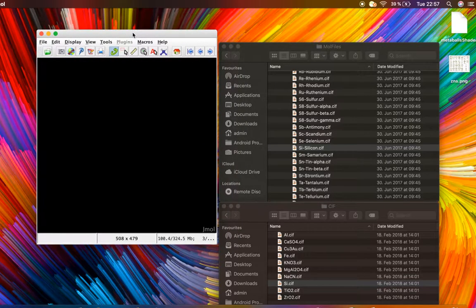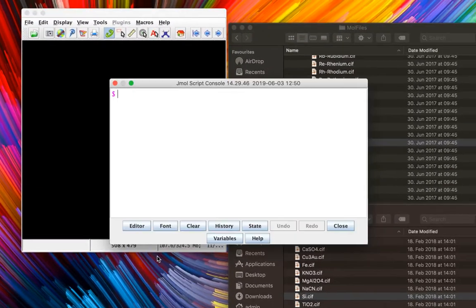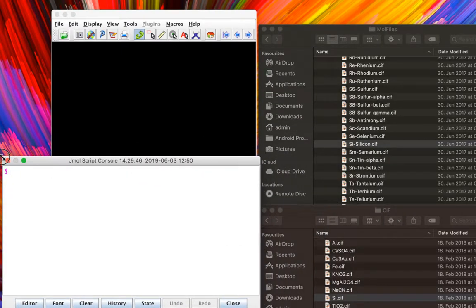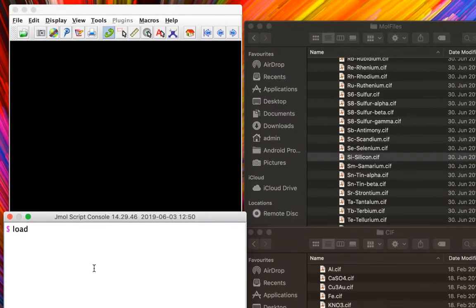The first thing you need to visualize a .cif file or a crystal structure is the address or path of the file. Go ahead and click on the Jmol window — the black area over here — and right-click to launch the console. This is the Jmol console and it is a really cool scripting utility with which you can perform a lot of powerful visualization tasks. The command we will be using is called `load`, which is used to load structures from file formats such as .cube, .xyz, .cif, .mol, or any other supported file.